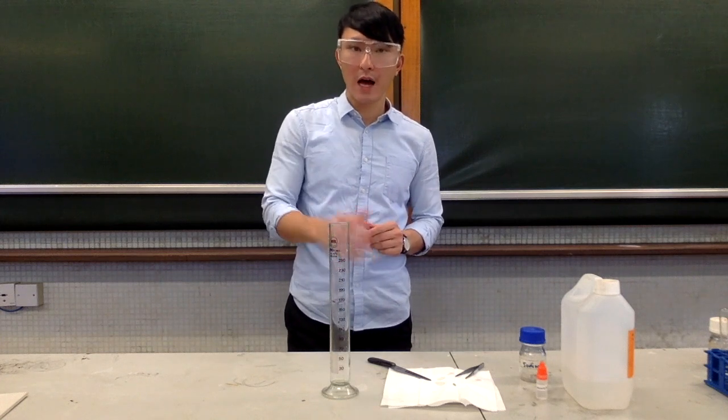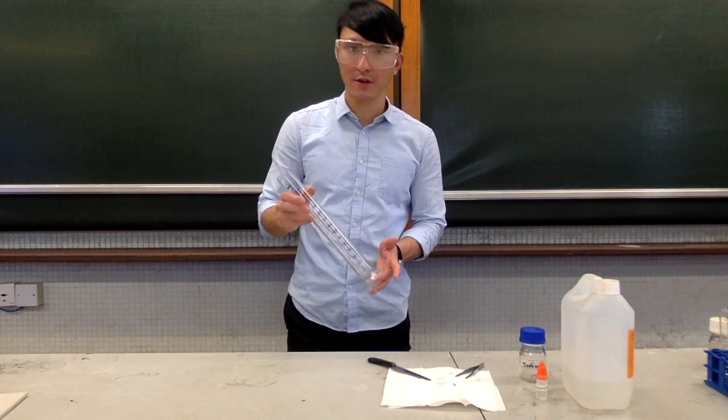After that, we are going to half-fill a large measuring cylinder with tap water.